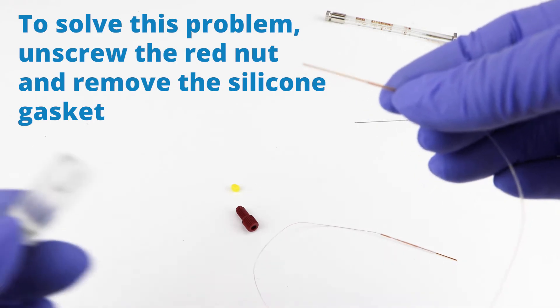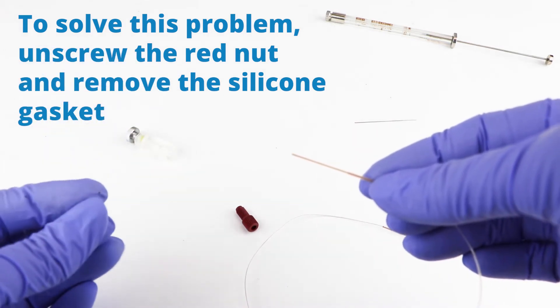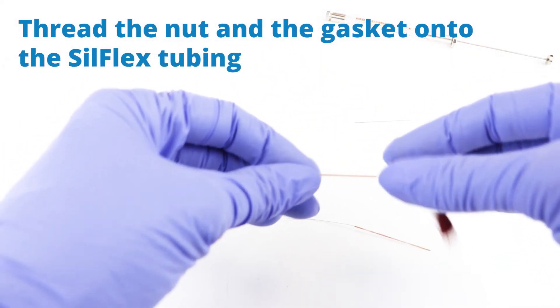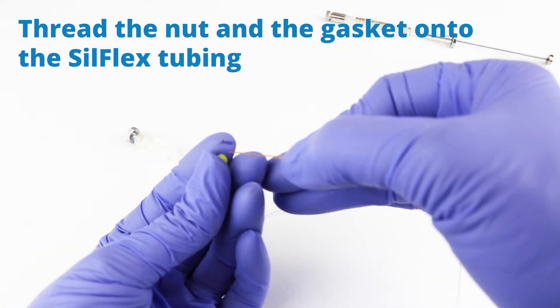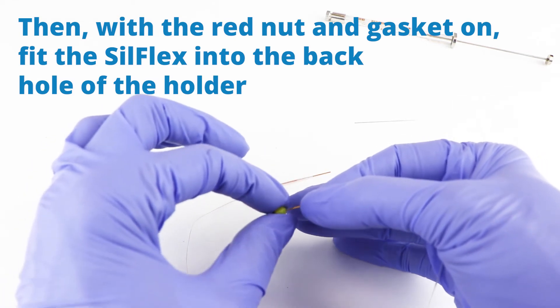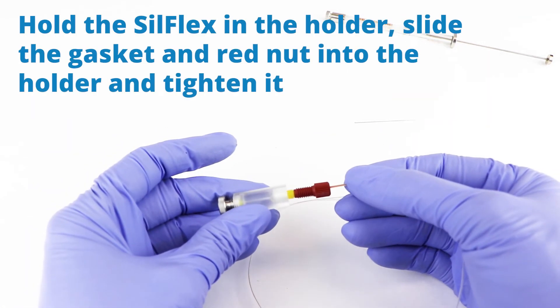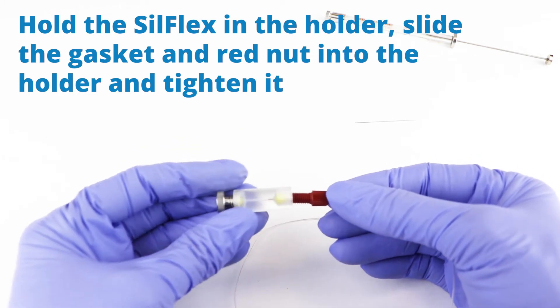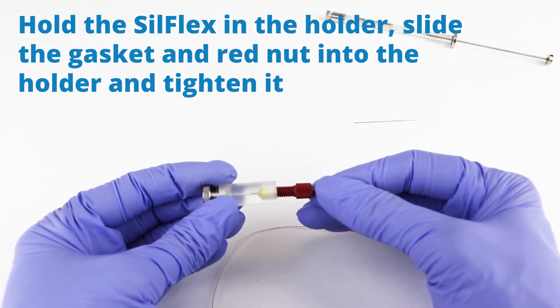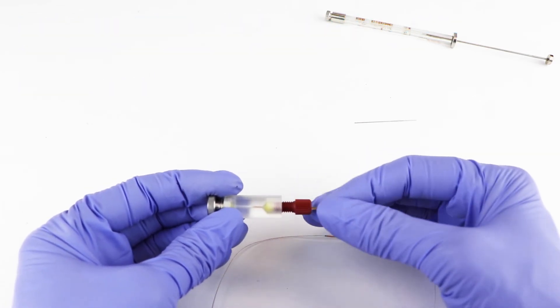Silflex tubing is very soft and sometimes it's difficult to fish it through the gasket during installation. To solve this, I unscrewed the red cap off the back and took the gasket out of it. Then I assemble this, put the gasket on, and screw them in together. You can see it right down inside there as it comes through. I'll push it a little farther in and then tighten this red nut, just finger tight so it won't pull out.